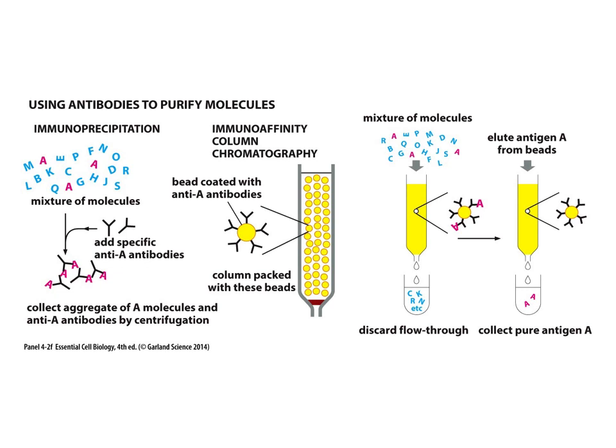That would grow up lots of the virus, right? So we could take the virus, we could homogenize it. So we would have viral lysates, if you will. If we take samples from people who've recovered, the convalescent plasma is going to have antibodies, and we could create a column with that plasma.